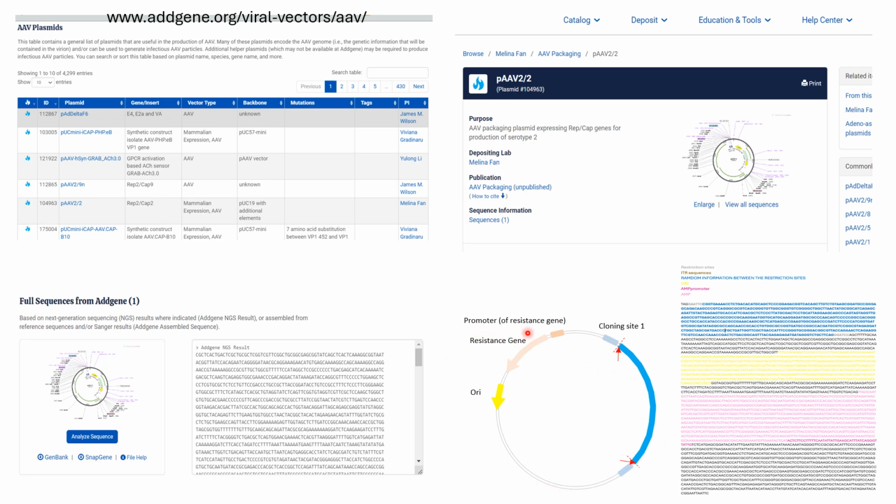You see here the promoter of the gene. The gene is the resistant gene. Okay, so you have the promoter and the gene, and then you have the ORI, and then you have this random sequence. So let's see it. For example, the random sequence is here. This is the sequence. I have highlighted it in blue. It goes clockwise. Okay, so we have first the cloning site here.